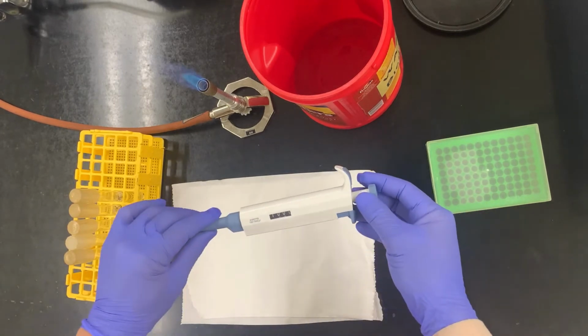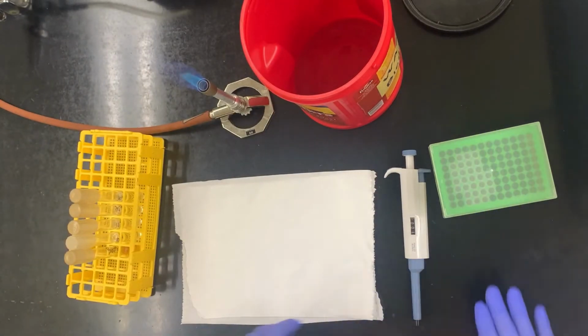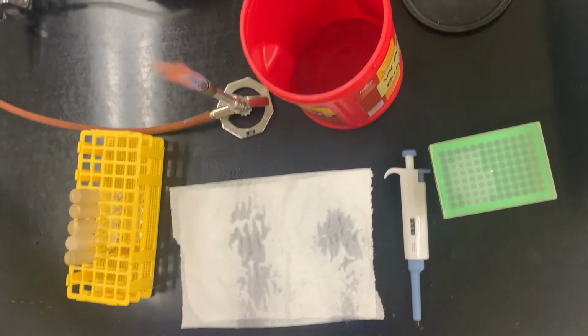Here I have my pipetter set at 1 milliliter. Remember, 1,000 microliters is 1 milliliter. I got my tips, and then my drip sheet. The drip sheet is optional, but it's super handy. I just got some paper towels, sprayed them down, and I'm going to work over my drip sheet.